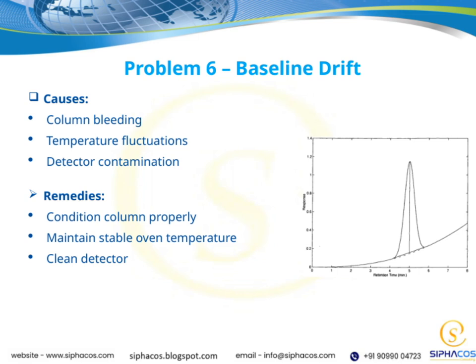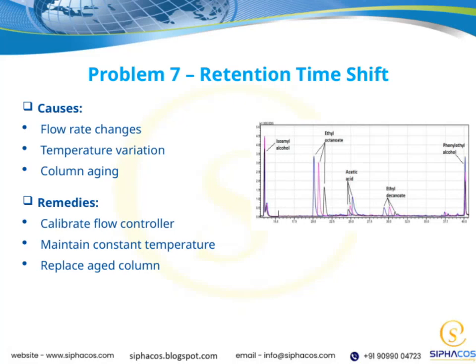Let's talk about problem 7, which is retention time shift.